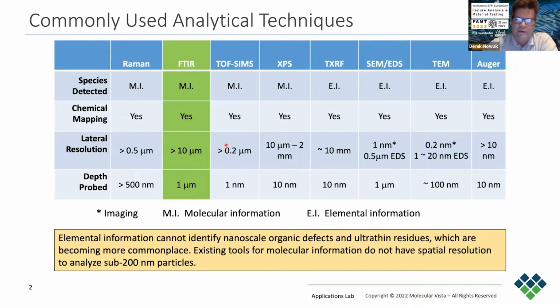So we end up in a location where we'd really prefer to get molecular information because we will be limited with just elemental information, being that fundamentally we're just looking at what atoms are building up the materials. But with molecular information, we can do a lot better job identifying what materials are physically there in terms of the molecular species, not just a collection of carbon, oxygen and such.